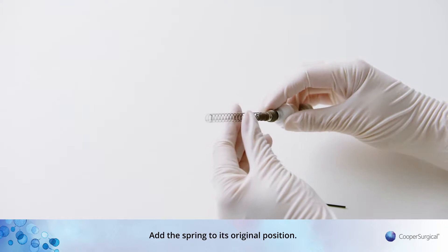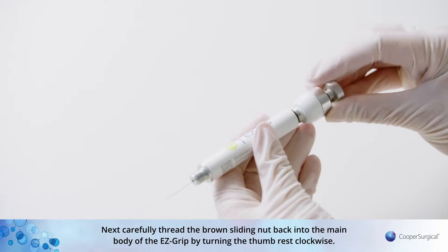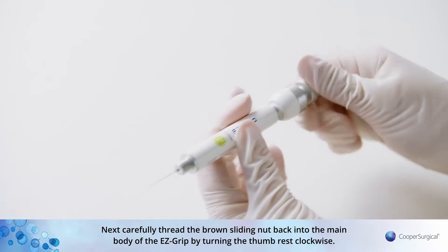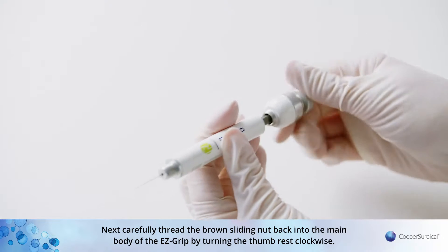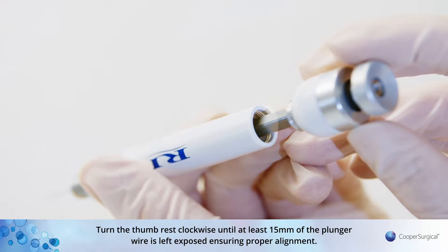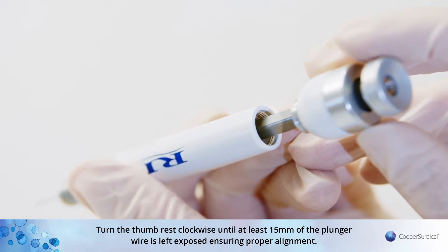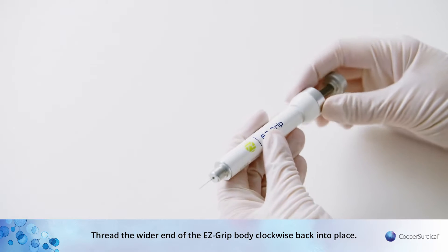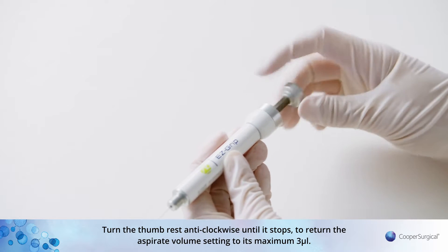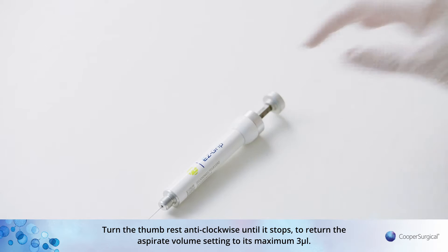Add the spring to its original position. Next, carefully thread the brown sliding nut back into the main body of the EZ-Grip by turning the thumb rest clockwise. Turn the thumb rest clockwise until at least 15mm of the plunger wire is left exposed, ensuring proper alignment. Thread the wider end of the EZ-Grip body clockwise back into place. Turn the thumb rest anti-clockwise until it stops to return the aspirate volume setting to its maximum 3 µL.